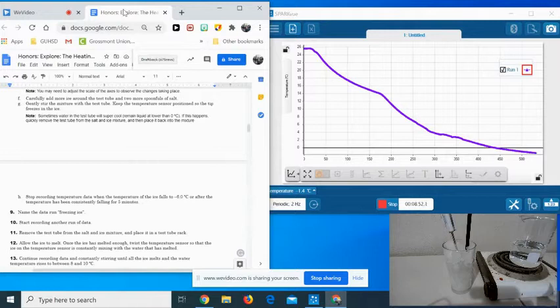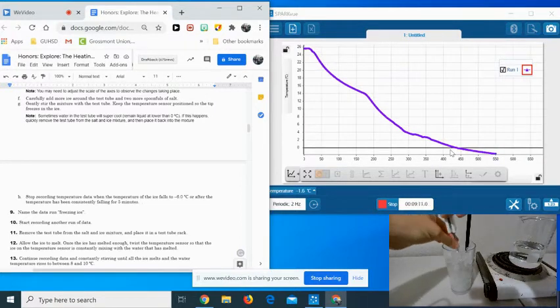At -1.4 degrees Celsius, and I'm still running, okay? So I've been running for 8 minutes and 55 seconds. And I'm just going to let it keep going and see what ends up happening to my graph over time, okay? But notice that you're starting to see this in this situation.